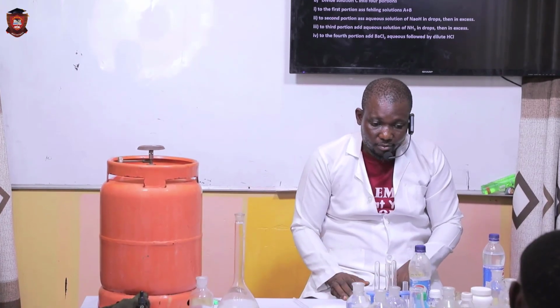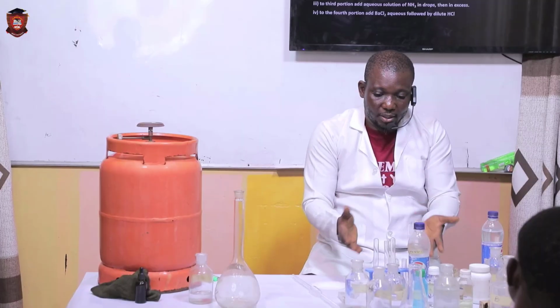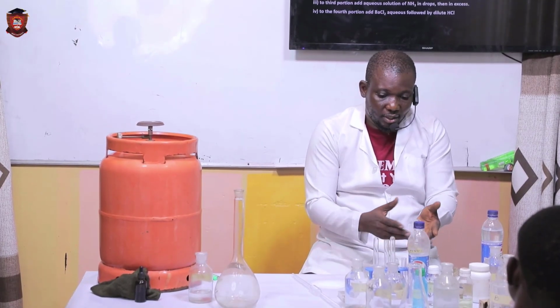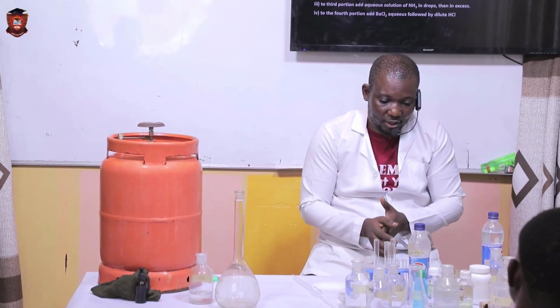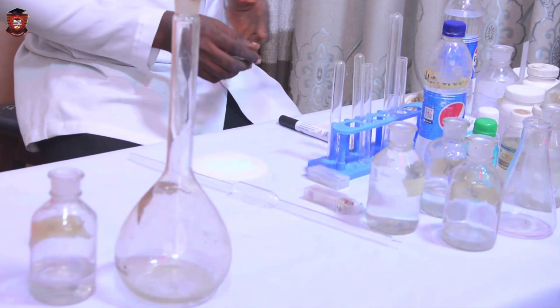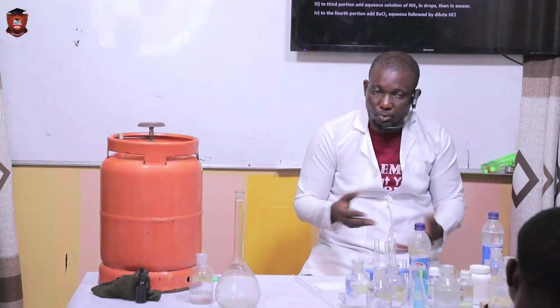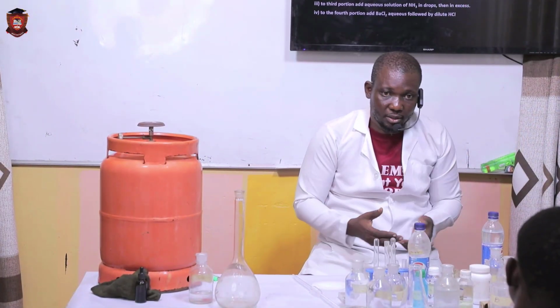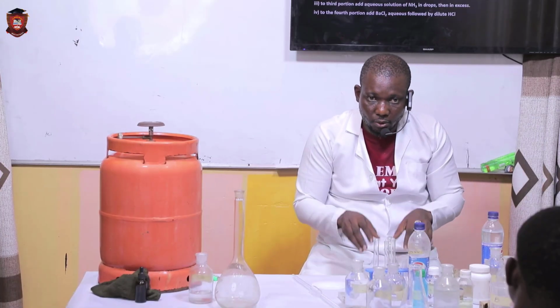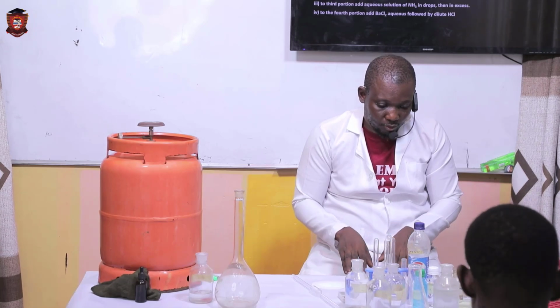So we have our salts, we have our test tubes, we have our test tube rack where the test tubes are arranged. We have our boiling tube. In the case of identification of simple sugar, glucose, since we have glucose in the mixture, that means we may require some form of heating to know if actually there is glucose. So we're going to see all of this in this video.